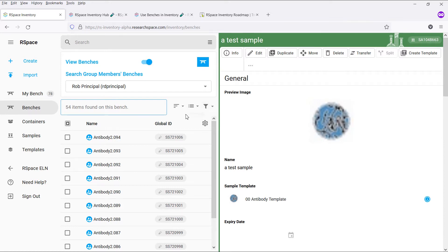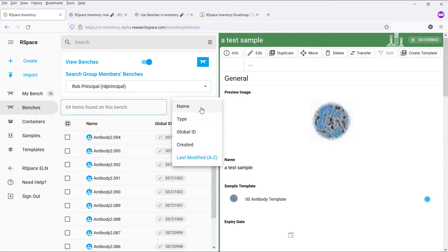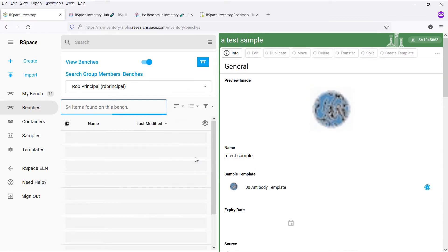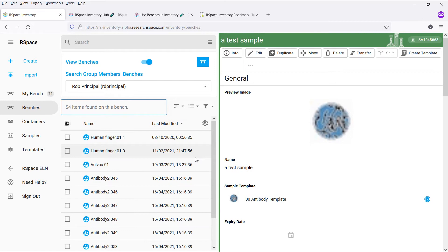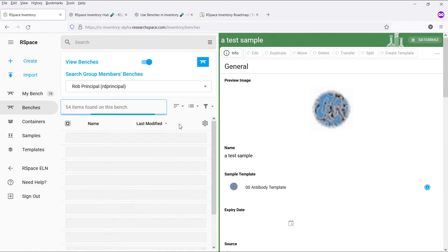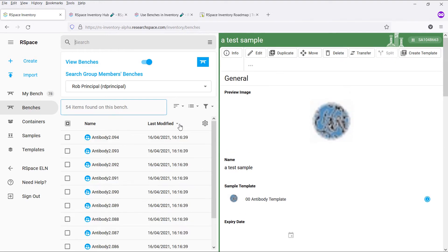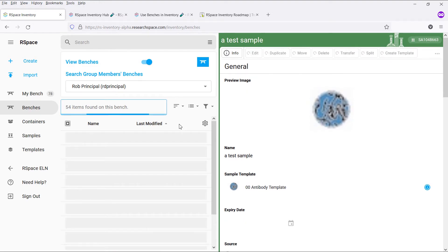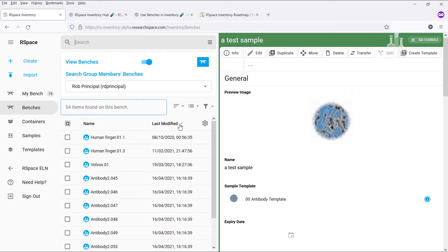In this release, we have added more sorting options to the results list, such as being able to sort by creation and last modification date. You can, for example, sort items by ascending last modified date to see if there are any items on your bench that you aren't using anymore that you'd like to perhaps check back in.